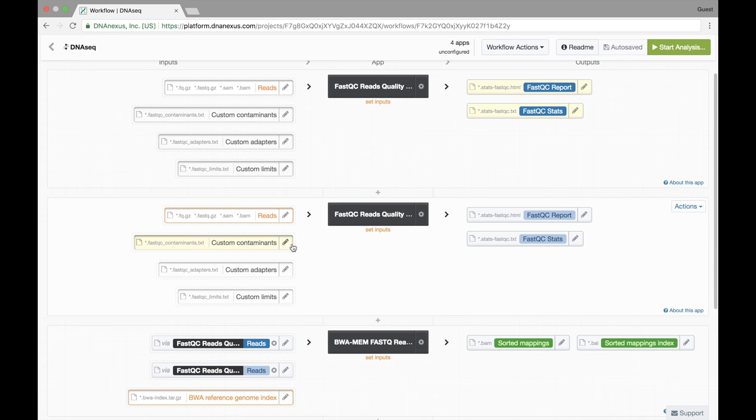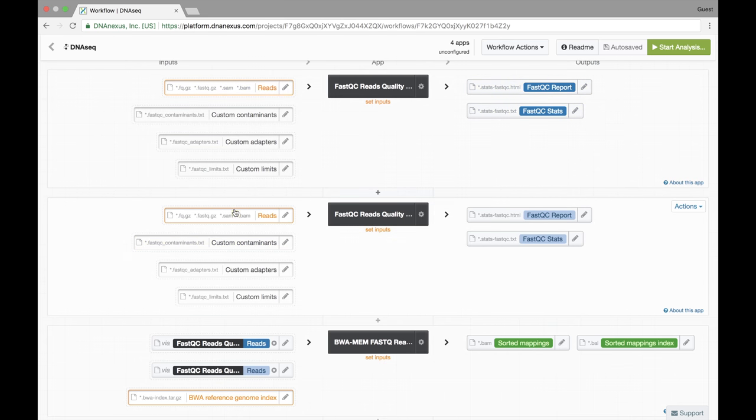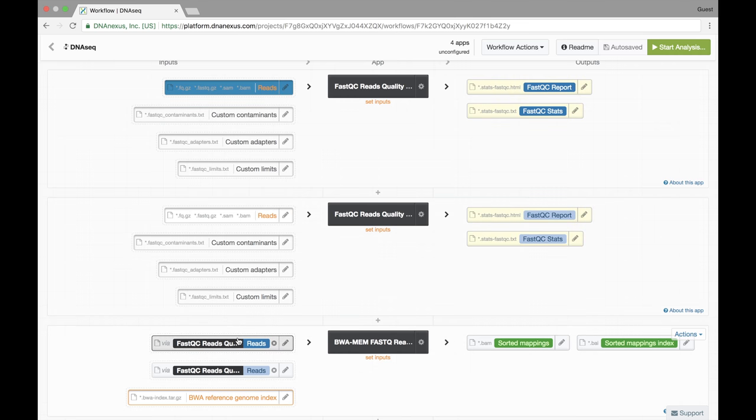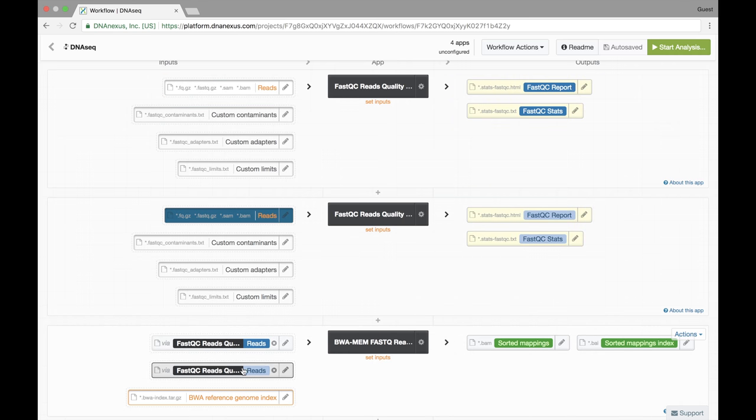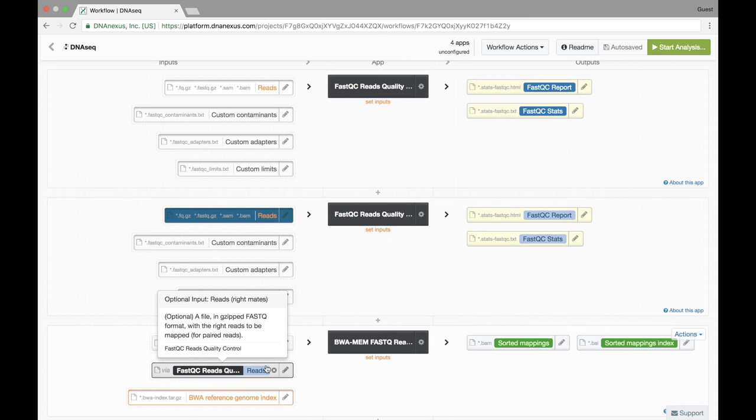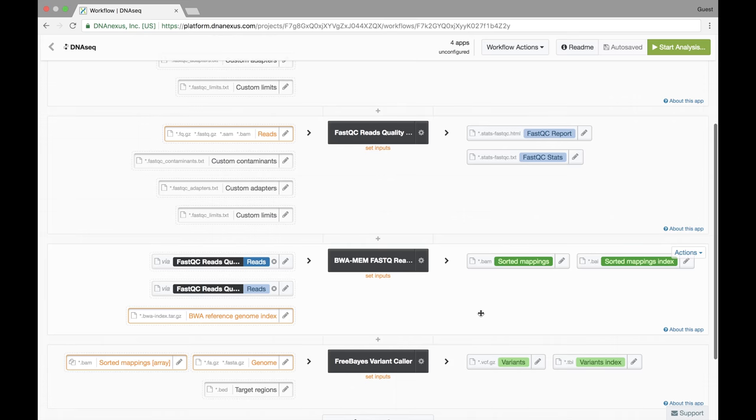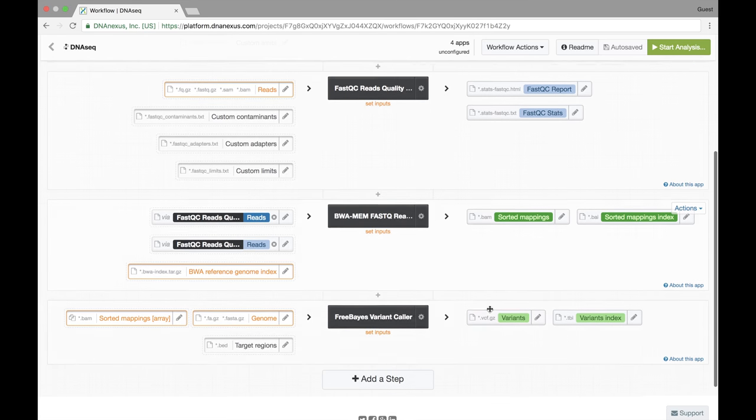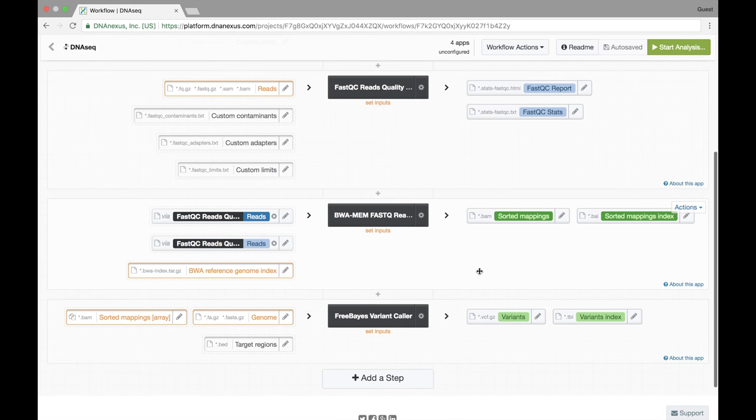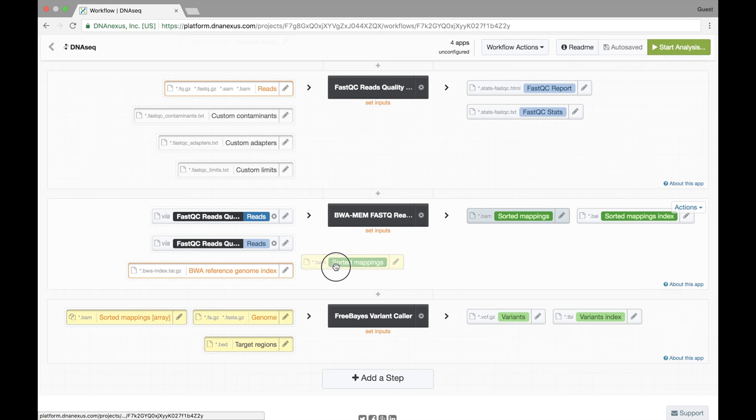And now when this workflow is run we will select the inputs for FastQC and those same inputs will automatically be set for BWMM. So now that we've set the inputs for BWMM we want the output BAM file generated by BWMM to be the input BAM file for Freebase variant caller. Again simply click, drag, and drop.